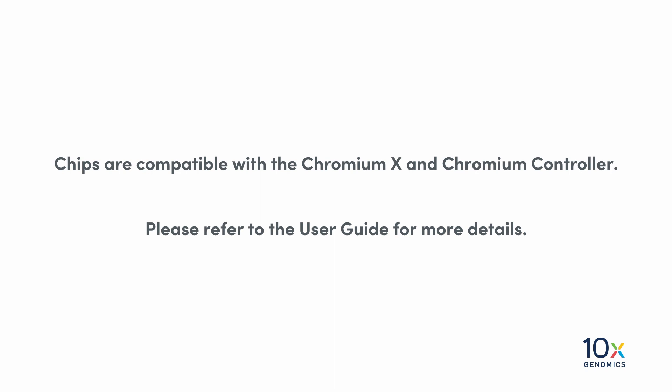Chips are compatible with the Chromium X and Chromium Controller. Please refer to the User Guide for more details.